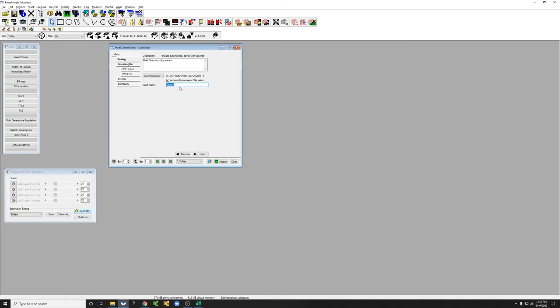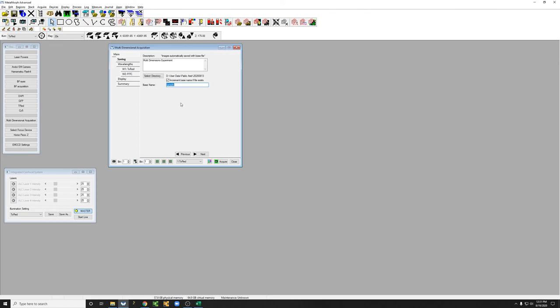If you acquire a data set and then acquire another data set, even if you haven't changed anything, they won't be overwritten and called sample and then sample again. Instead they'll be called sample, sample1, sample2, and this really helps keep your data organized. That's all we need to worry about within the saving subtab.